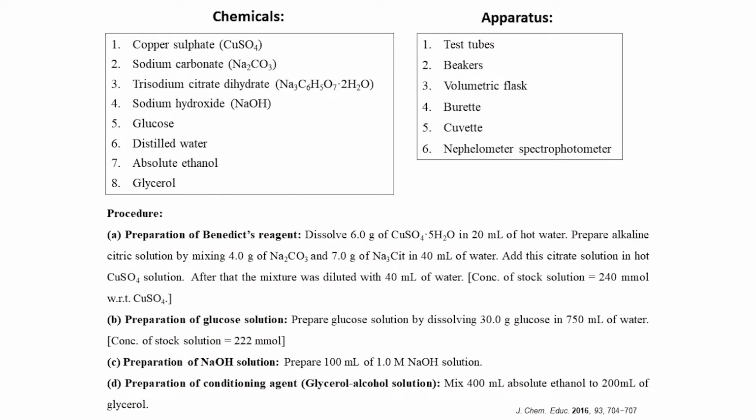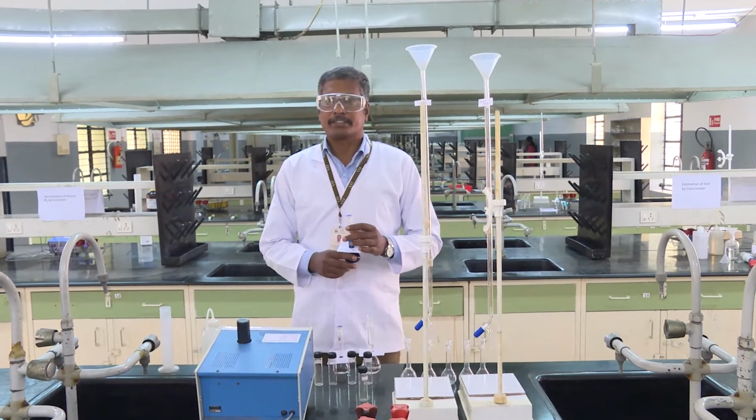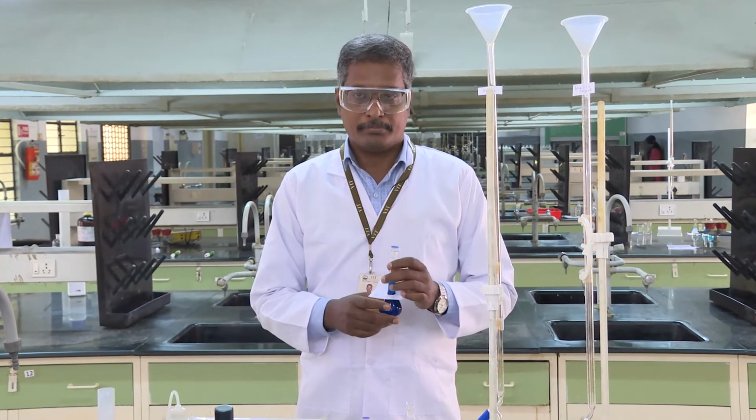Okay, let's do the experiment. Okay, students, let's start the first part of the copper oxide nanoparticle synthesis, which involves the optical measurement by our naked eye.